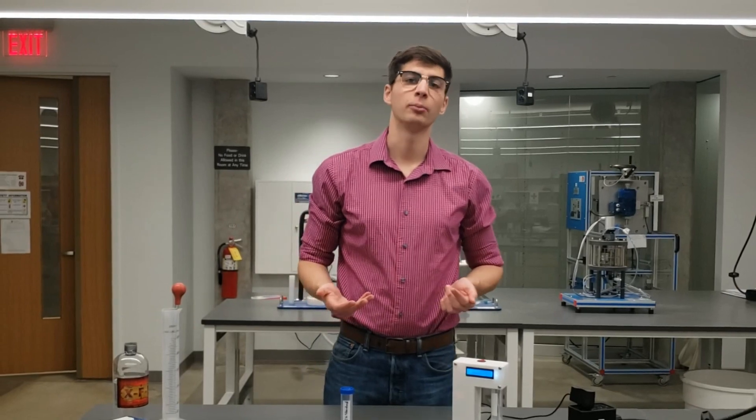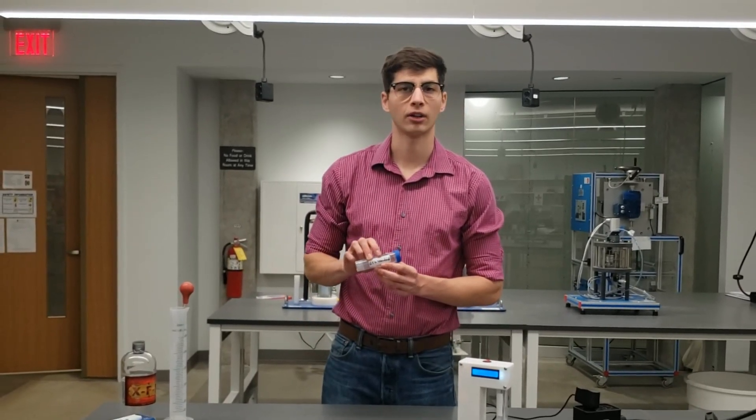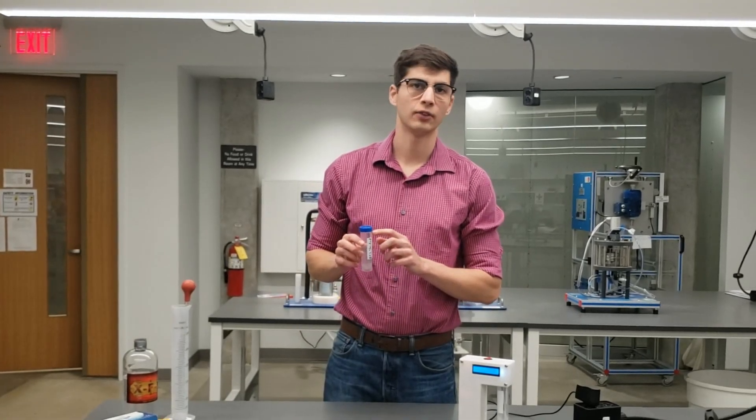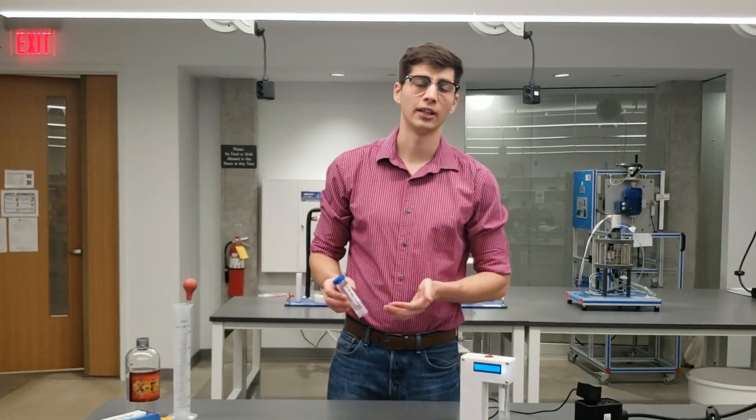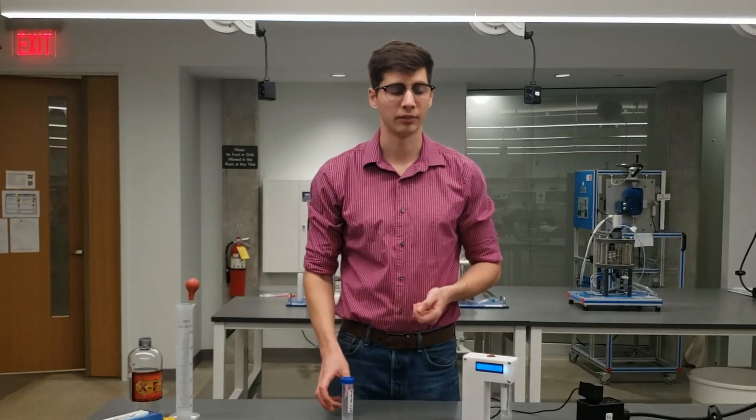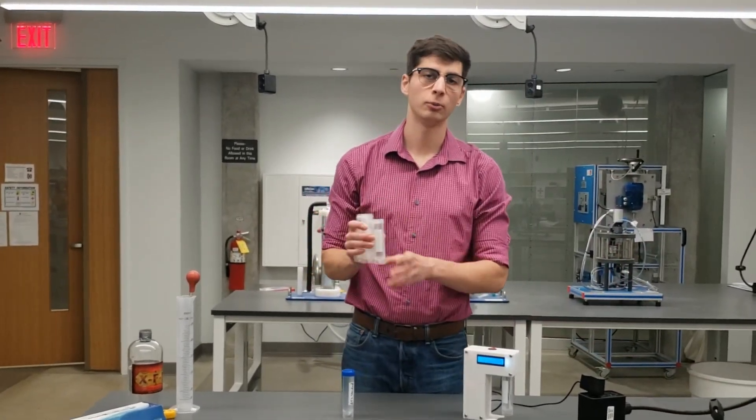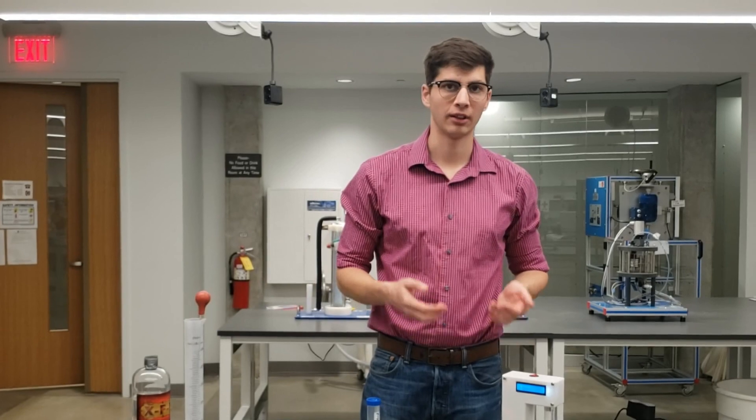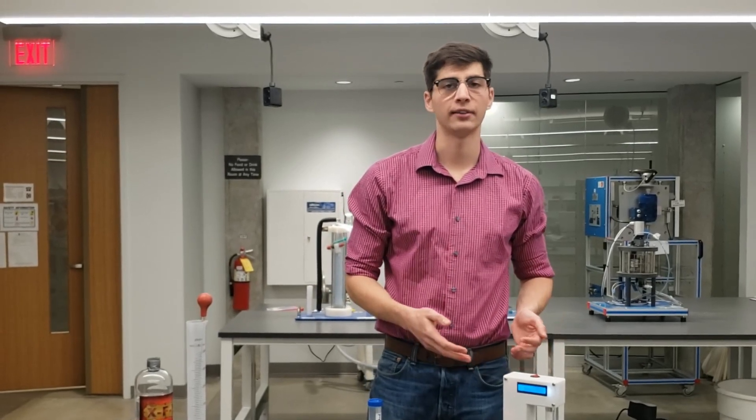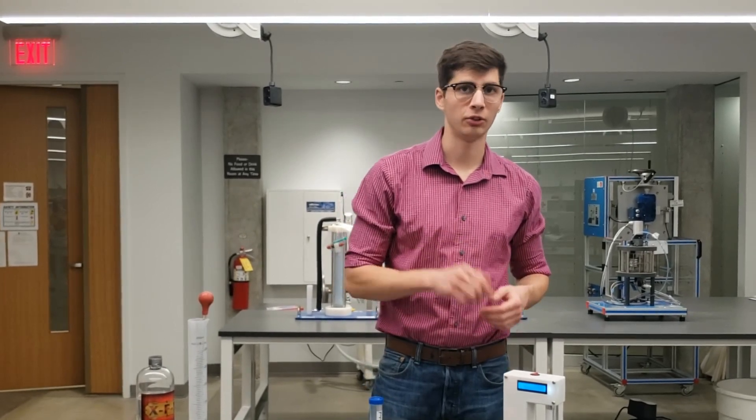Besides the detector, some other things that will be included are a 0.5% alcohol content standard which only contains 50 milliliters, so you'll end up having to make your own at some point. However, this is a very easy process that I'll go through in other videos, and you'll also be given a few sample tubes to run your samples and standards in the detector. Everything included with the detector gets you started on using the device and you will not have to purchase any other pieces of equipment from me to use the alcohol detector.